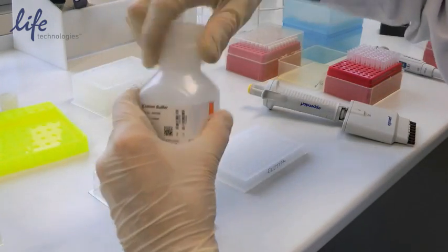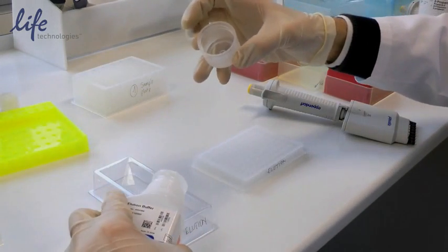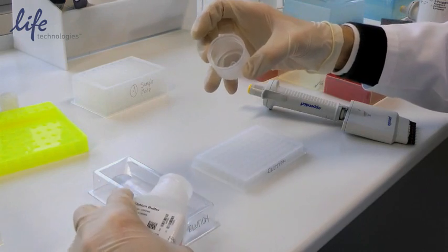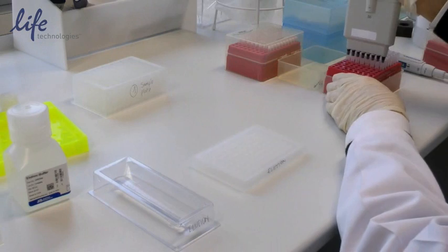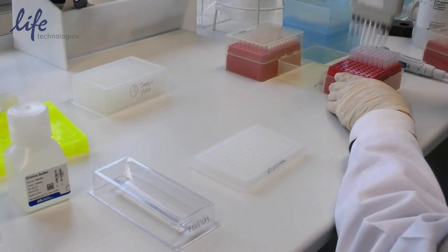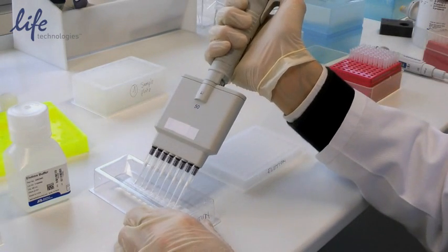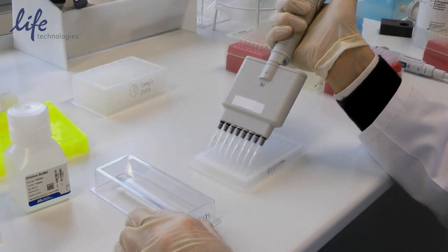Now we're going to pipette the elution buffer. The elution buffer is the other required element. So we place it in here and we can work again with a multi-channel pipette. We can use just one set of tips which is again important for high throughput.